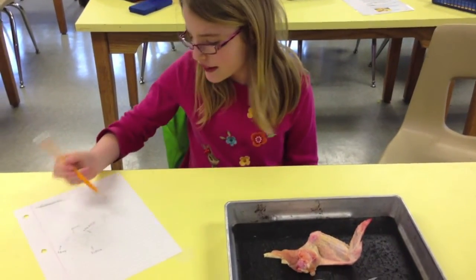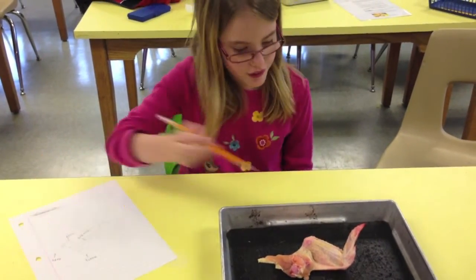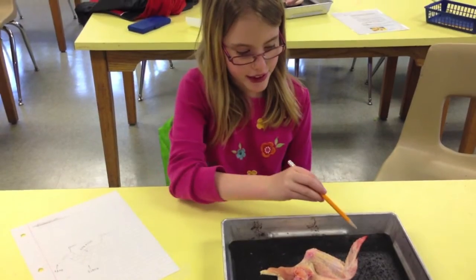Next, students drew and labeled the structures. This is the shoulder, and then this is the radius, and then this is like a hand.